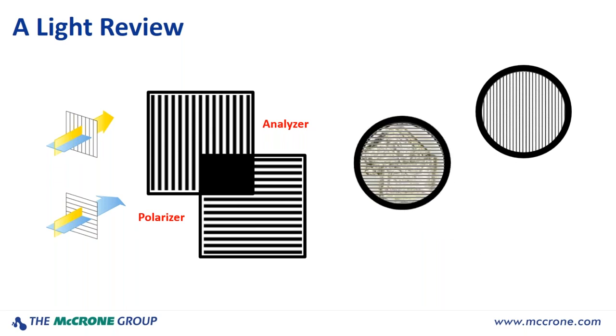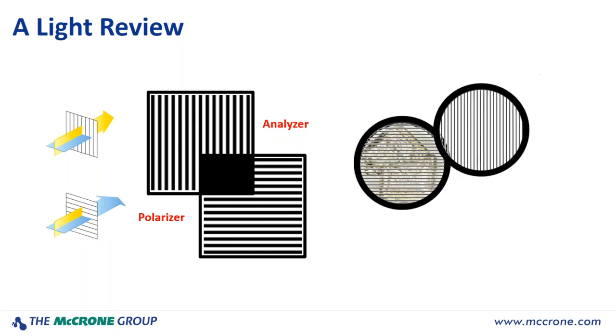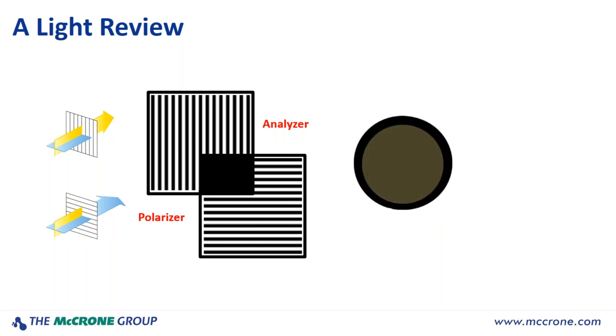Polarizer, analyzer, dark field, introduction of a crystalline structure provides all of these properties which we can look at.